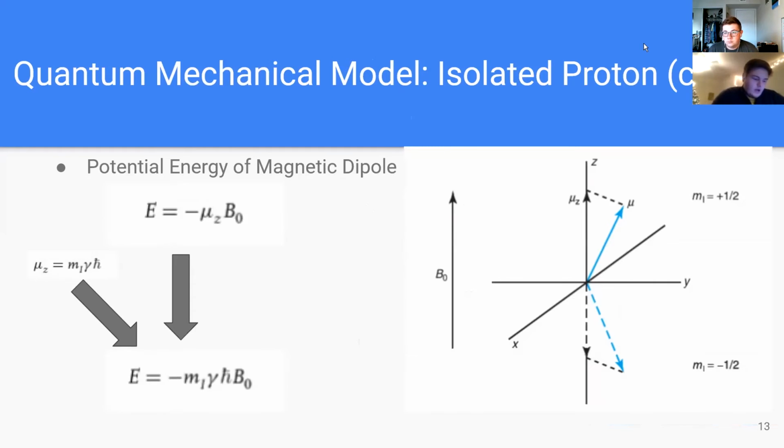So going along with this, on the right there, that's the magnetic dipole I was talking about. That's a visual representation of it. Those black arrows are what we were talking about: 2 magnetic moments equal and opposite in sign. That's without a magnetic field applied, which is B sub 0. They're called degenerate, so they have the same energy. Now, once we apply a magnetic field to these already magnetic moments, we create energy.